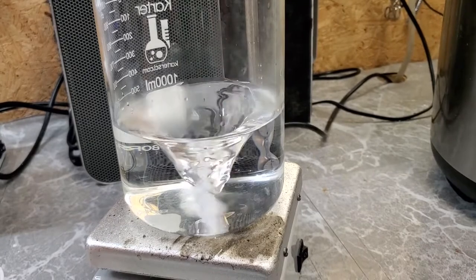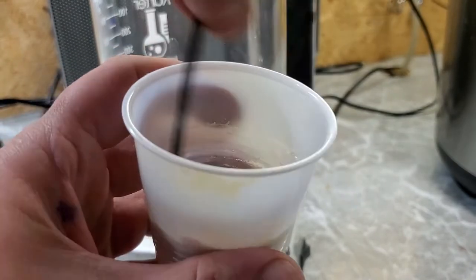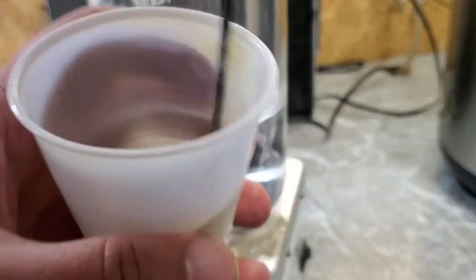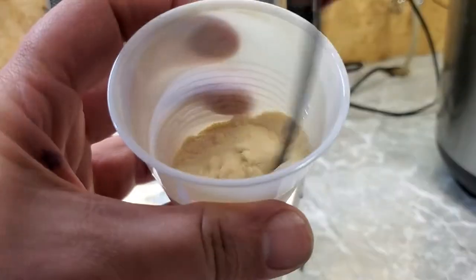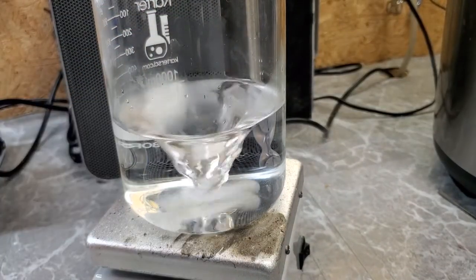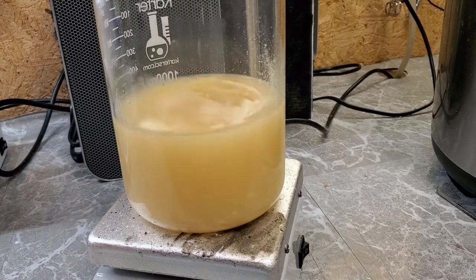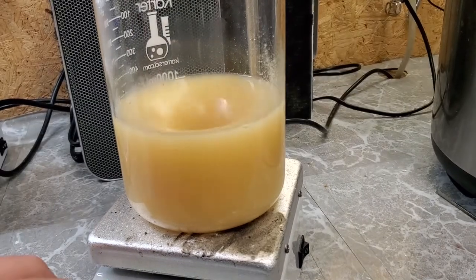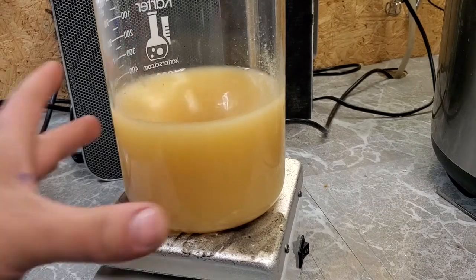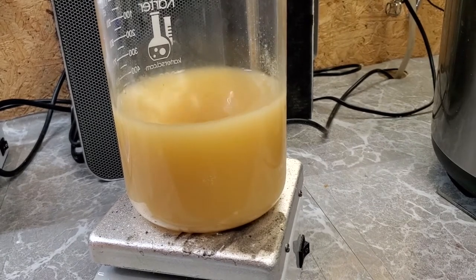Now that everything is added and weighed out, I'm just going to mix the powders together a little bit in this cup just so it's slightly homogenous. This step isn't really required, but it's something I like to do anyway. Then add the powder into the water. I have stirring turned up pretty good. Water's already getting warm, so the hot plate is doing its job. Just let it do its thing until it comes to a boil.